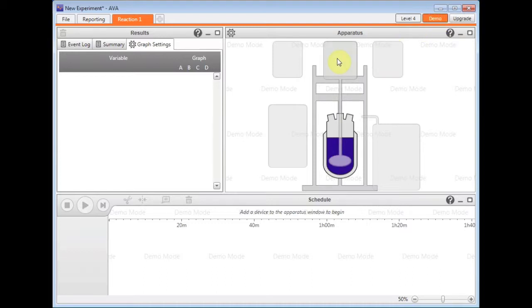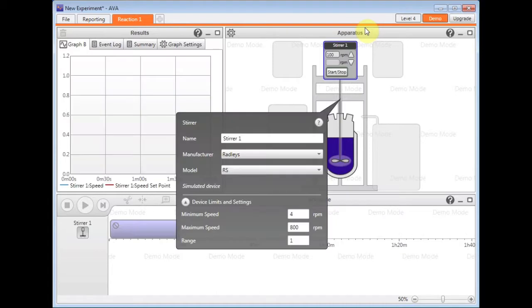I'm going to add some pretend equipment to my apparatus window here to start with a stirrer to this zone at the top. Click on the stirrer icon and then click off of this to apply.